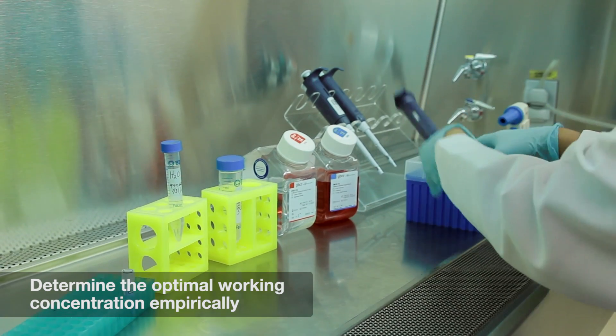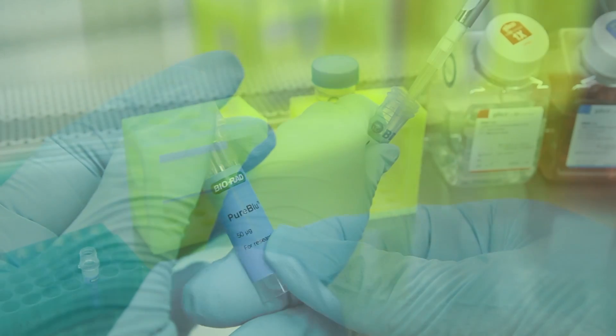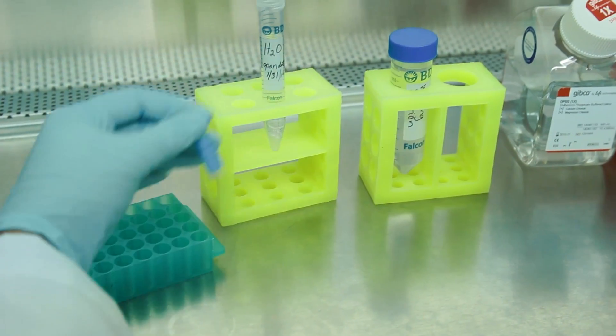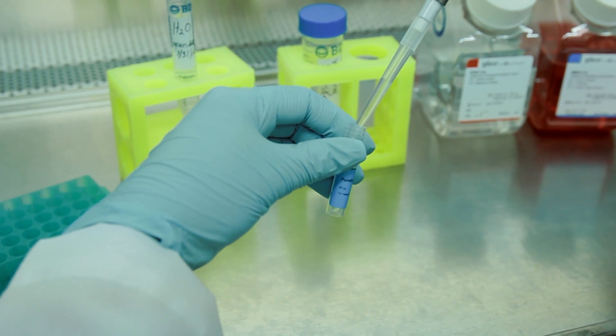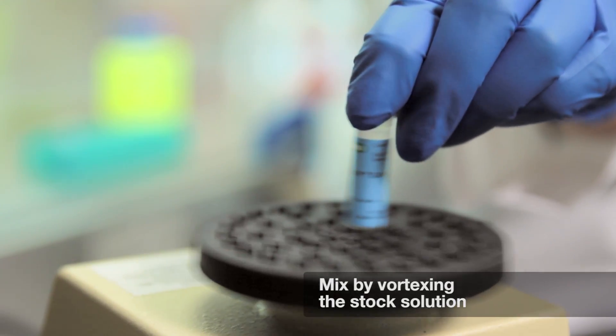To stain your fixed cells, first create a working solution. Take one vial of your Pure Blue DAPI dye and add 500 microliters of deionized water to generate a 100x stock solution, and then mix the tube by vortexing.